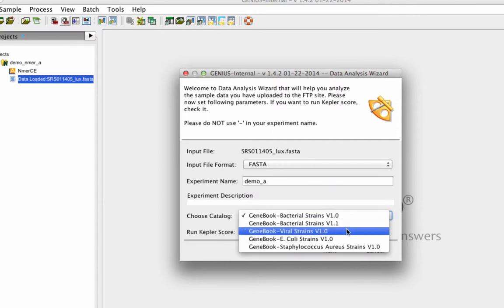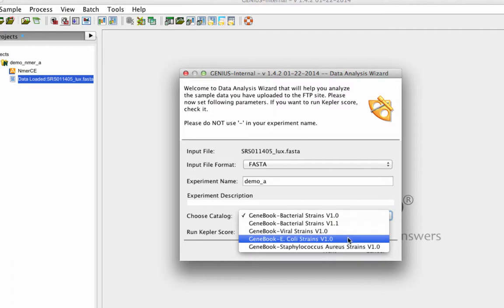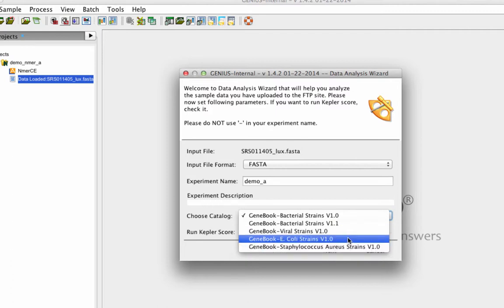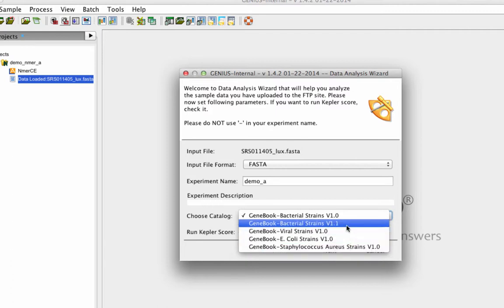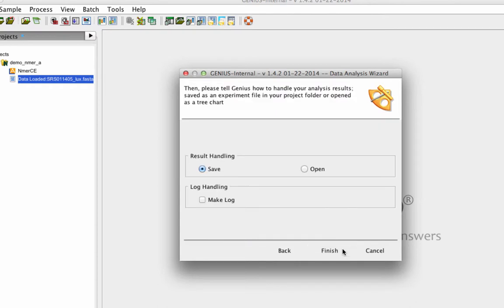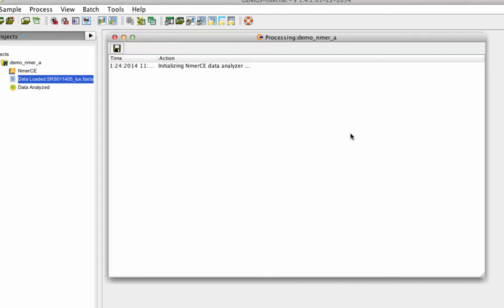Genius has multiple libraries to choose from and you can select the bacterial, viral, antibiotic resistance, or virulence factor library to compare your sample against.